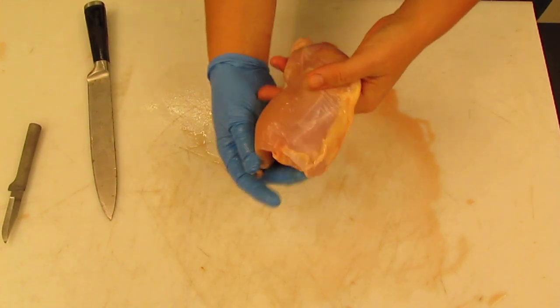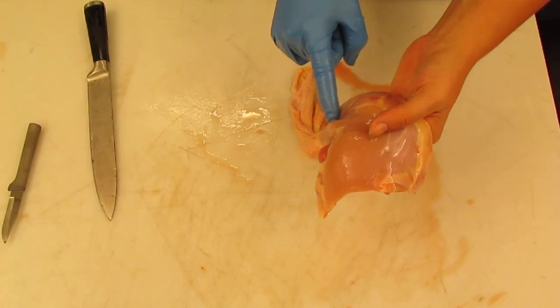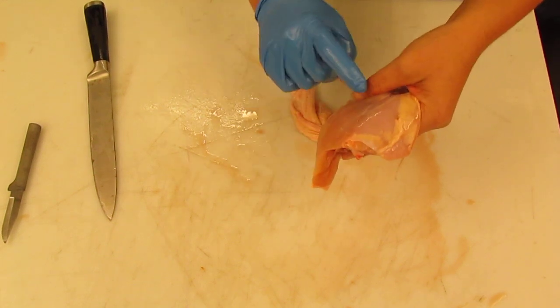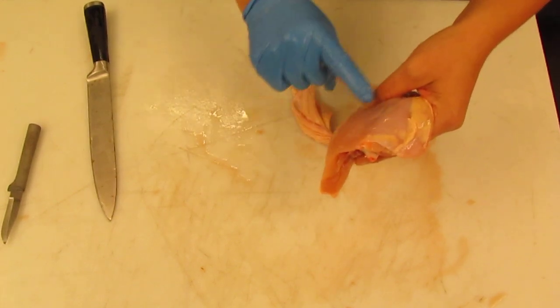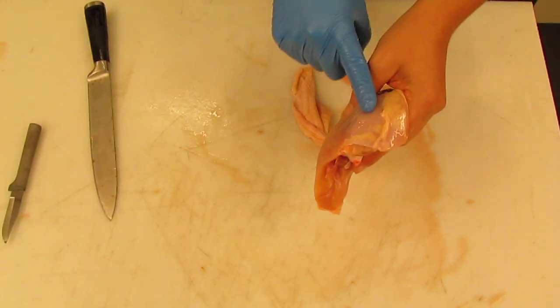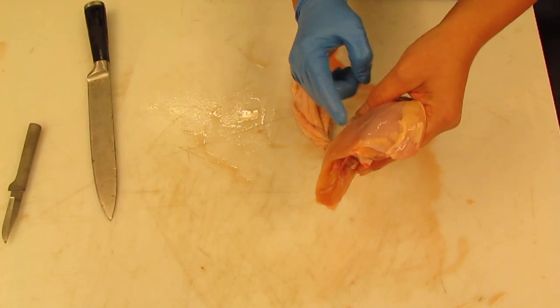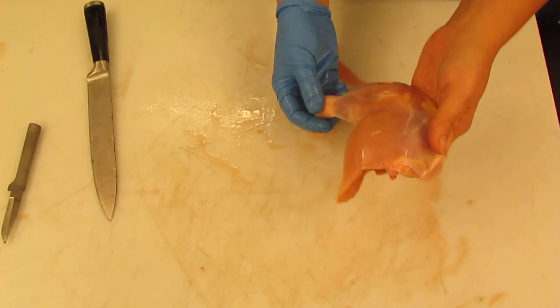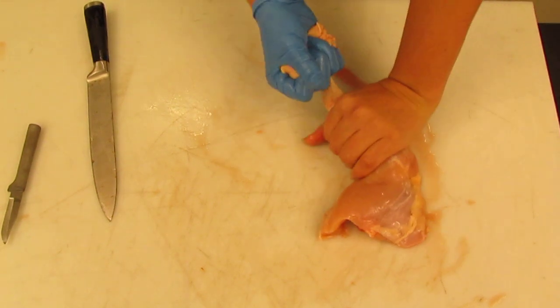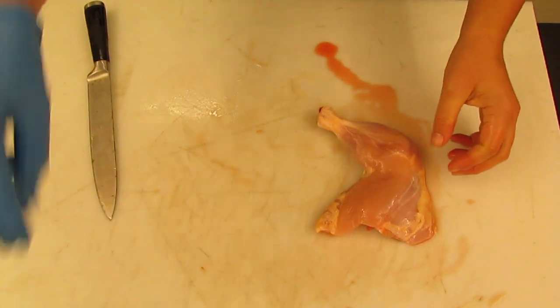we're starting to be able to see that there are white lines through the muscle tissue itself. Also, if we look really closely, we can see that there are skinny little lines going in this direction and in that direction. These are the fascicles, okay, of the muscle itself. Remove the skin the rest of the way here, so it's not in the way.